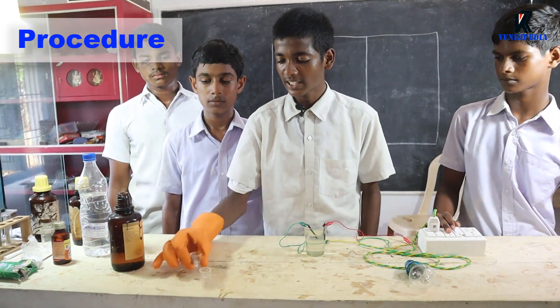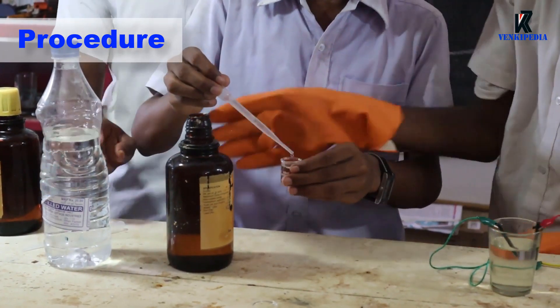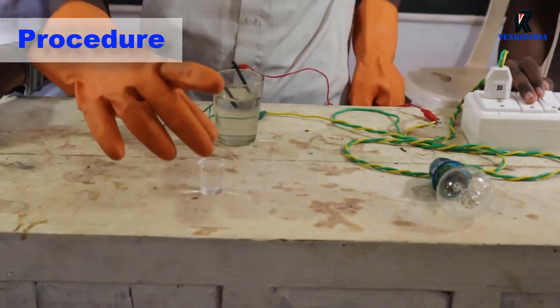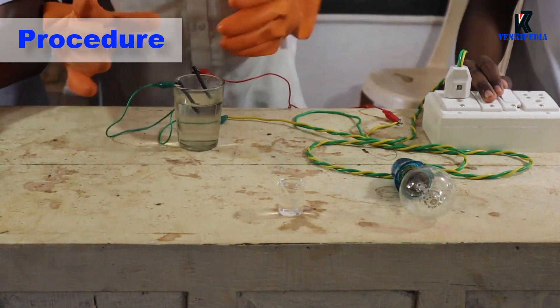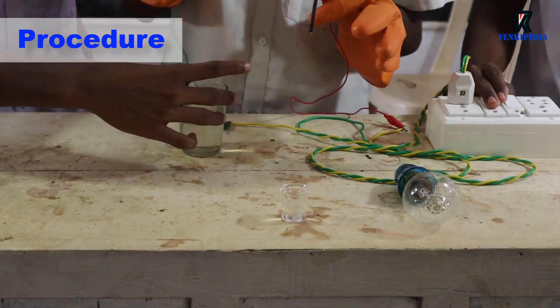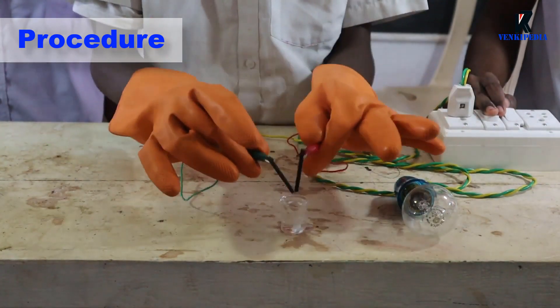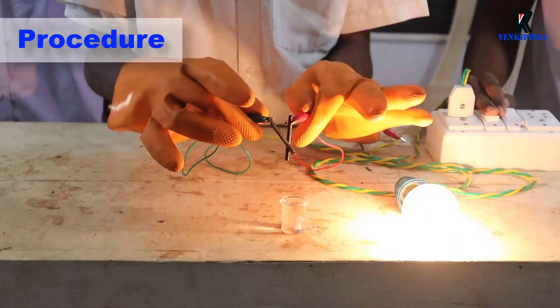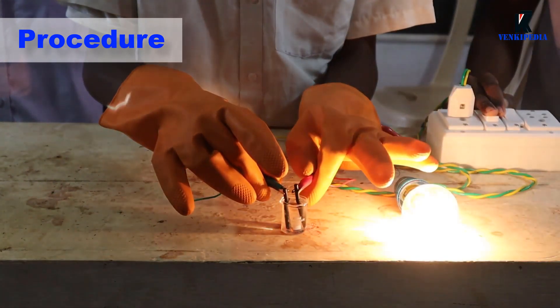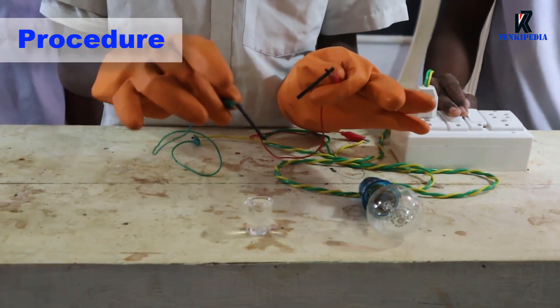Prepare dilute nitric acid in another beaker. Now wash the graphite rods again with distilled water. And test the conductivity of dilute nitric acid. We can see that the bulb is glowing. This indicates that dilute nitric acid conducts electricity through it.